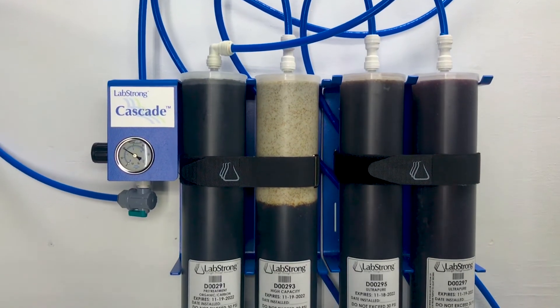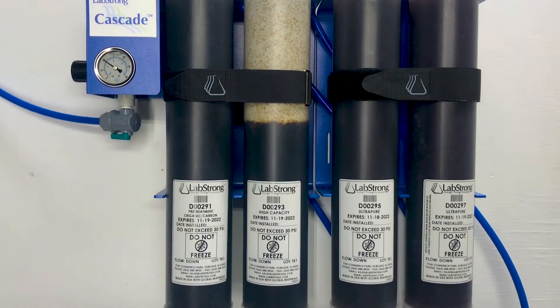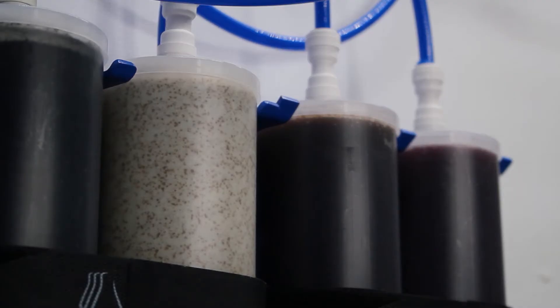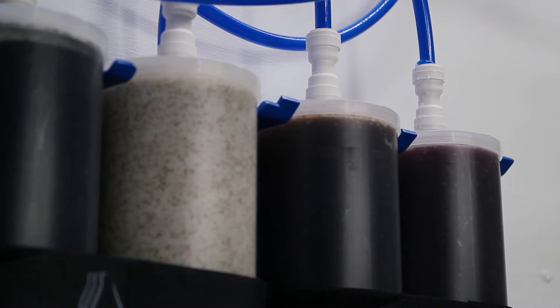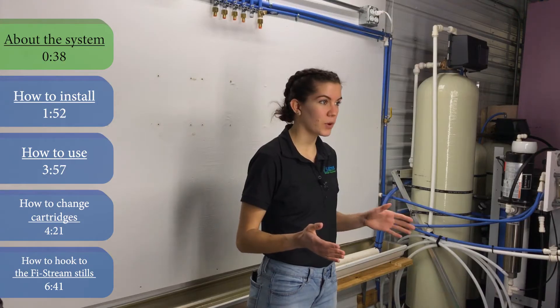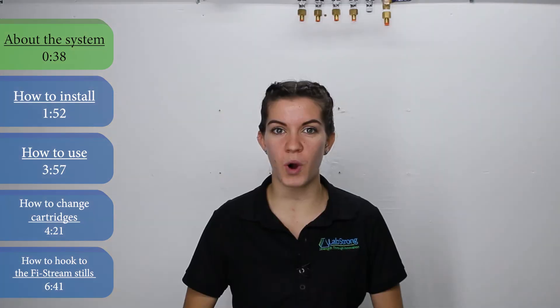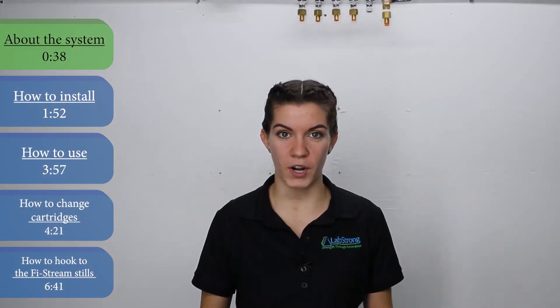The LabStrong Cascade is a versatile DI Type 2 purification system. It was built with efficiency in mind, so its simple, no-frills design gives you almost instant access to pure water. And with a small footprint and no need for electricity, the system can be placed nearly anywhere to produce Type 2 water through a tap water hookup or through pretreatment water.